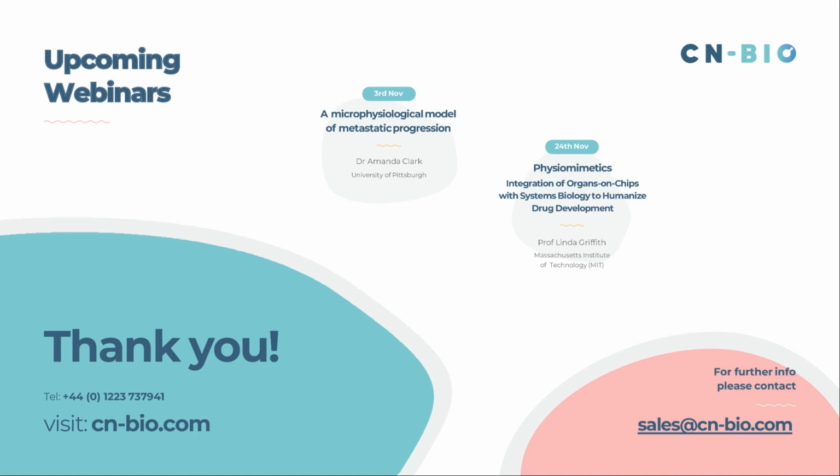Okay, yeah, great question. Again, actually, there's two questions there. So one about scaling and one about common media. To the scaling question first, it's a really key aspect of any multi-organ MPS system, and something we think really very hard about. There are a number of ways to scale these platforms, and we don't have a one-size-fits-all approach to this, where we standardize our scaling. We produce scaling metrics on an application by application basis.